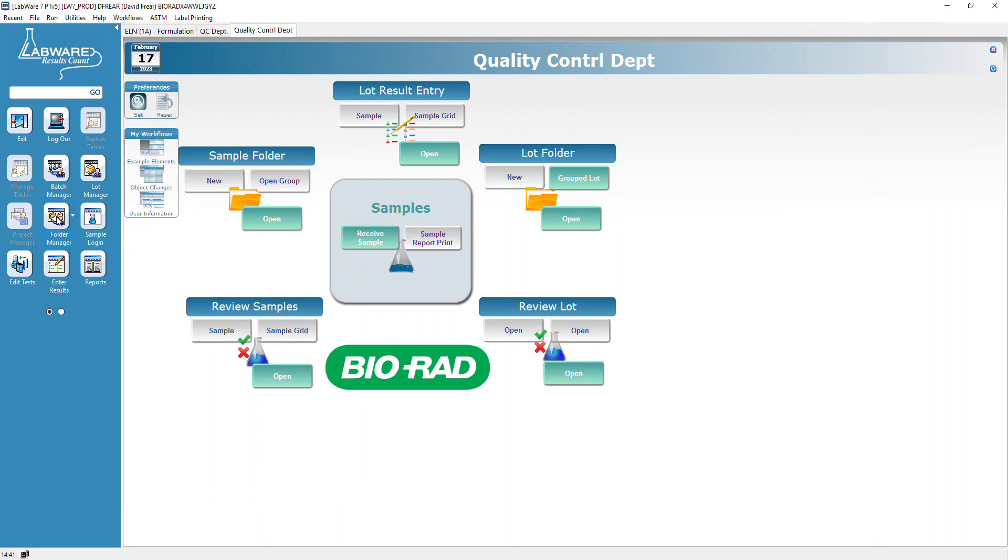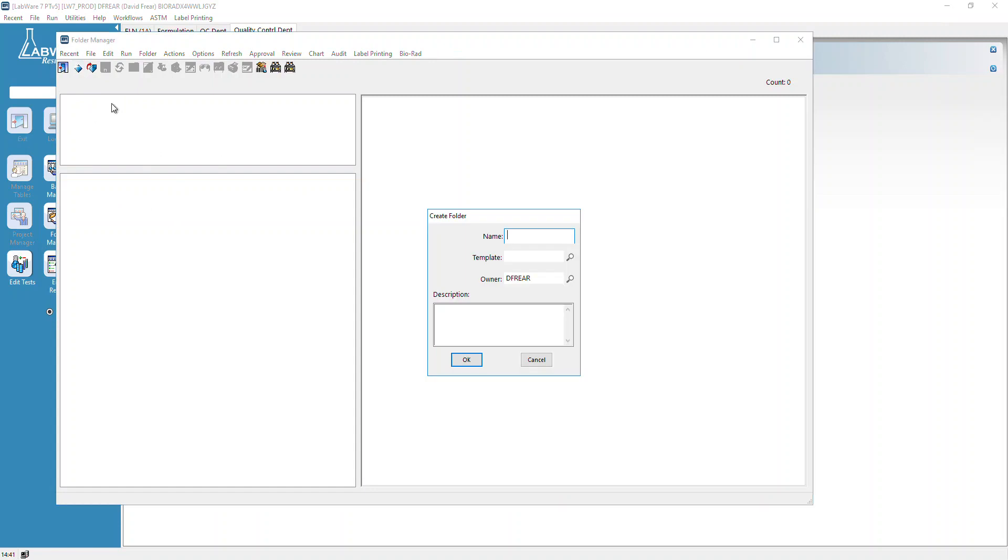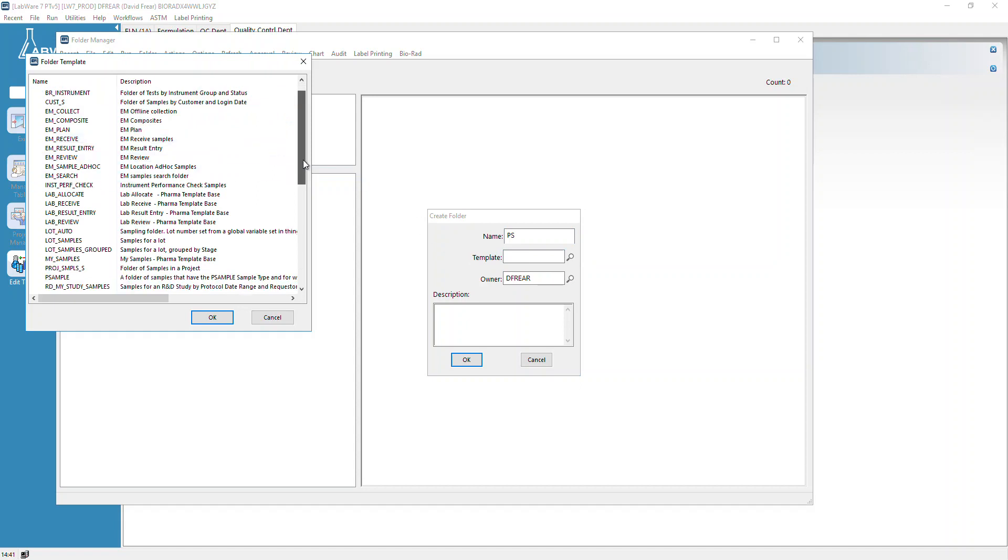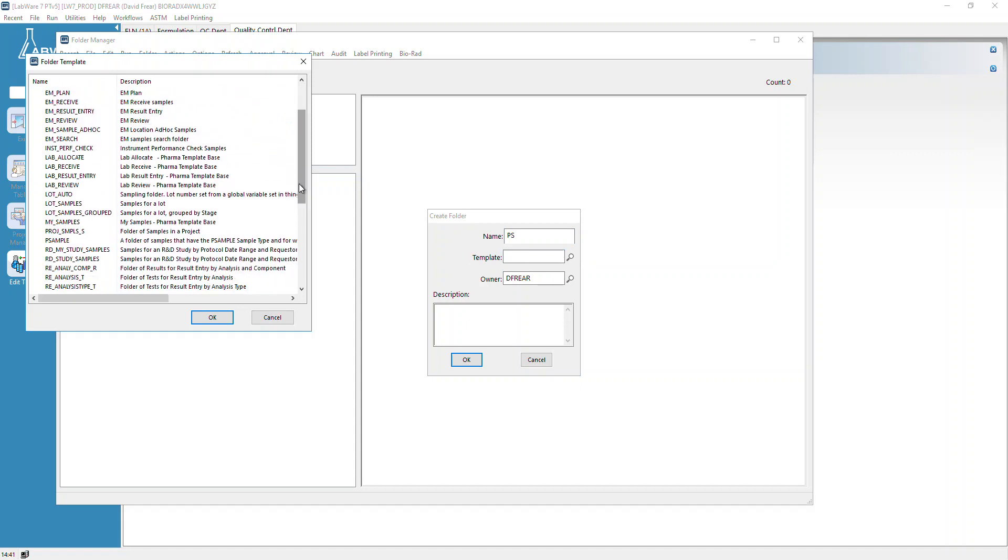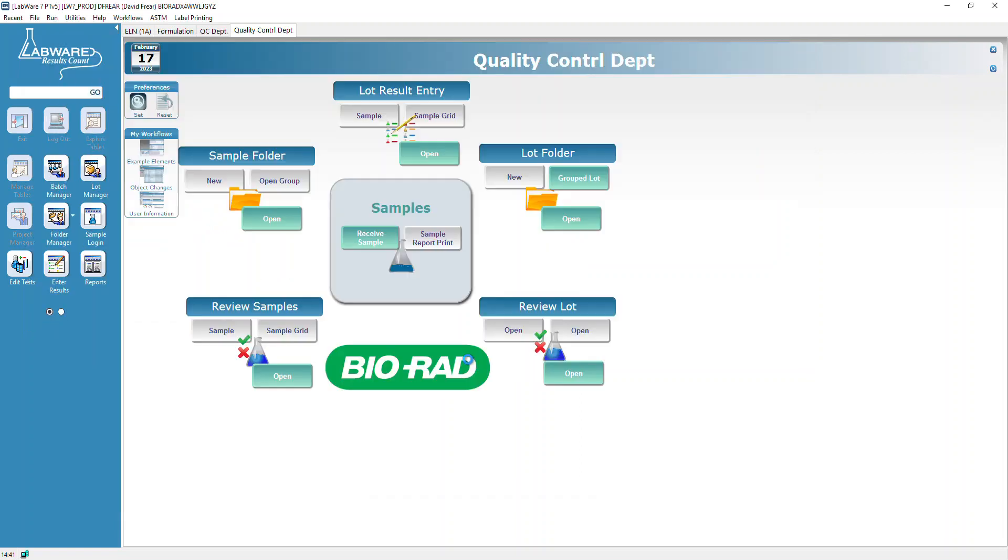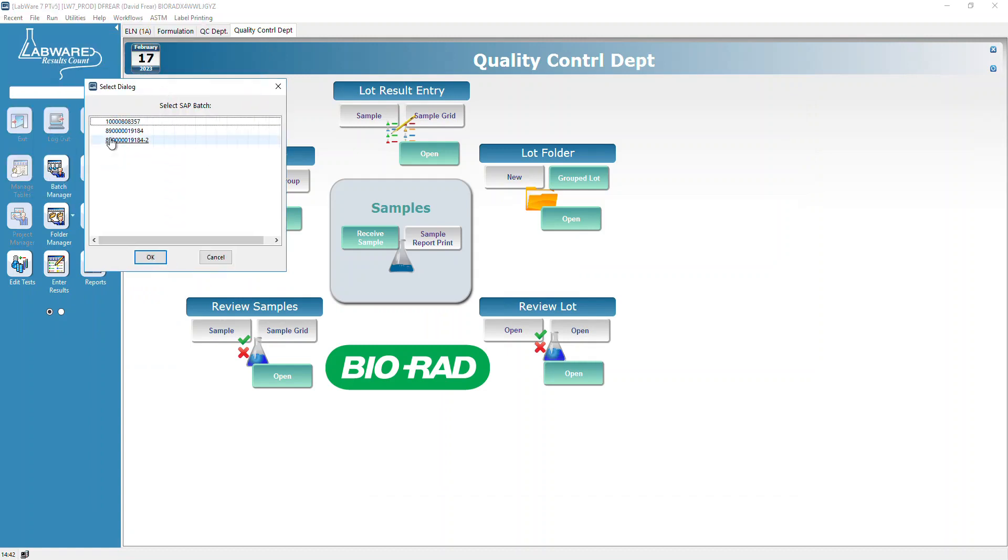We're going to open Folder Manager and click the New button. I'm just going to call this P sample or PS, and now I'm going to look for my template. What's it called? P sample.